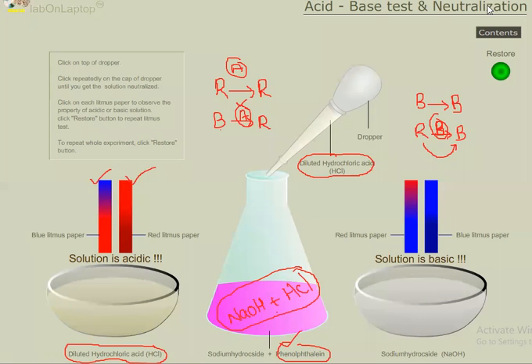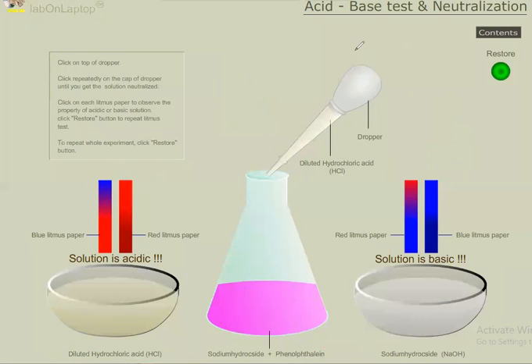What is a neutralization reaction? When acid reacts with base, it gives salt plus water. In this beaker, sodium hydroxide is already there.